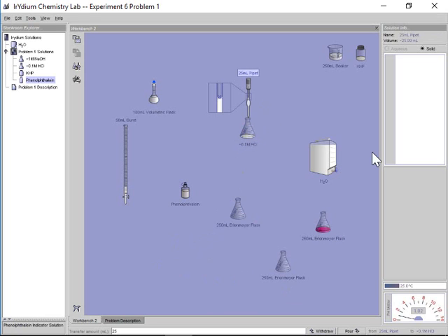We can actually take a look here. If I pour in 25 here, so that one was fine. Let me see if there's actually 25 left. So I still have about 30. Let's see if I can withdraw 25 here. This would totally just be for practice sake here, because what you realize is, oh, I actually used up all the HCl. You might be able to calculate, oh, what was the concentration? But now I have no more solution left over to actually utilize for your actual experiment.